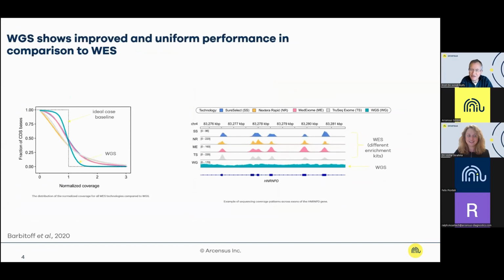And let me quickly demonstrate this slide to you because it so nicely shows one of the limitations of the exome. For exome sequencing, we have one laboratory step, and this is the enrichment step. There are some commercial kits available. We have tested some of those. The names are given on the right side. And you see, even though these are perfectly validated kits for the enrichment step, there are significant differences in the configuration of the exome stretches that can be covered with whole exome sequencing. So look at the first line in blue, followed by the orange, the pink, and the gray.